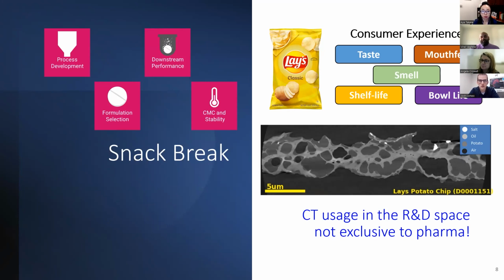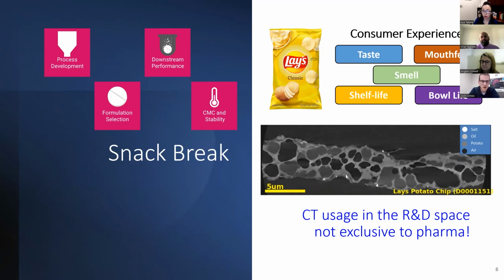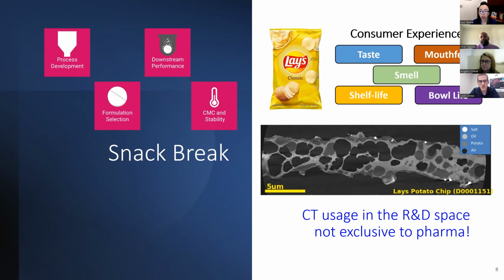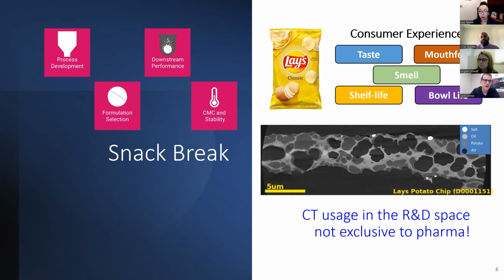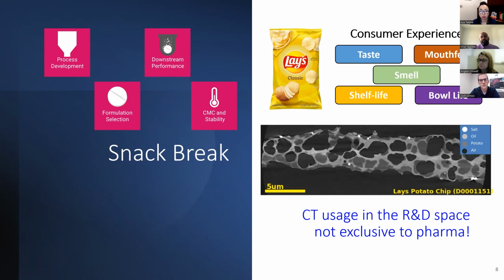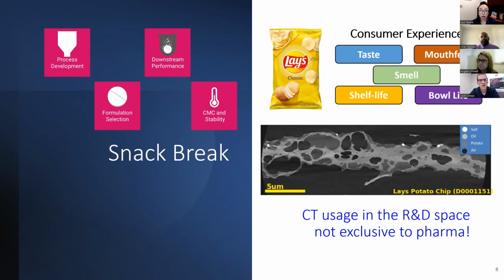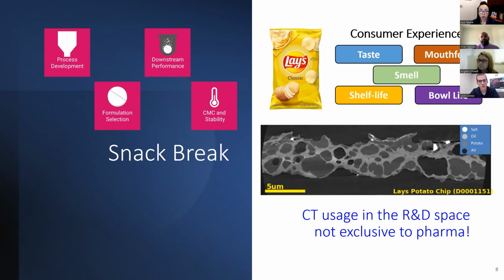Yeah, so I think we'll probably touch on that second one in a moment. But with regards to the first question on size calculation, we are using our machine learning analysis algorithms to classify each microsphere and differentiate it from the air. And then once we have that classification of each microsphere in the scan, we'll typically measure with an equivalent spherical diameter algorithm.